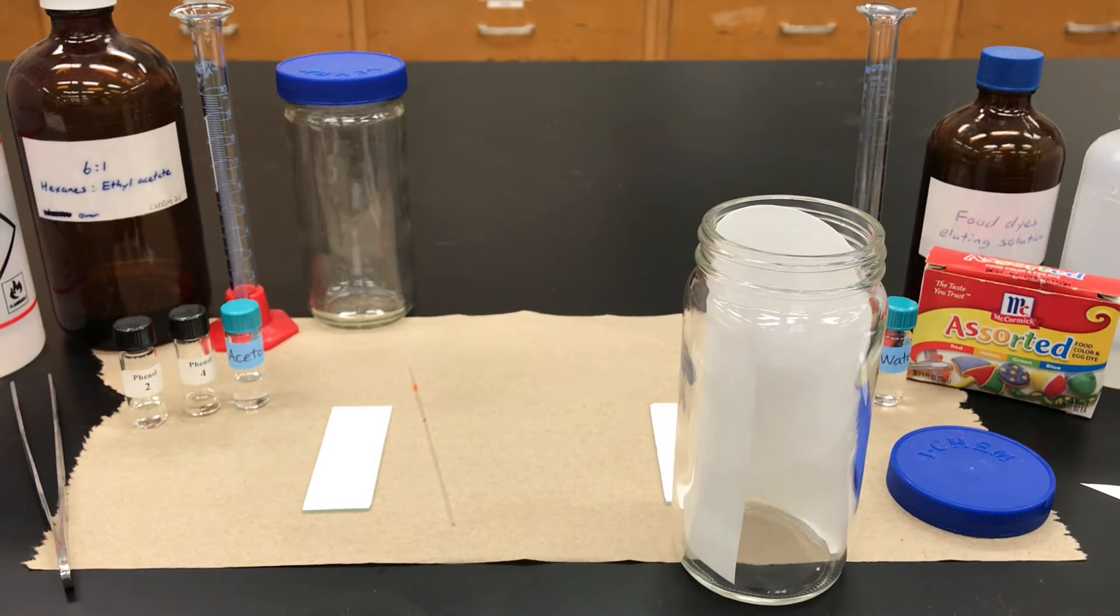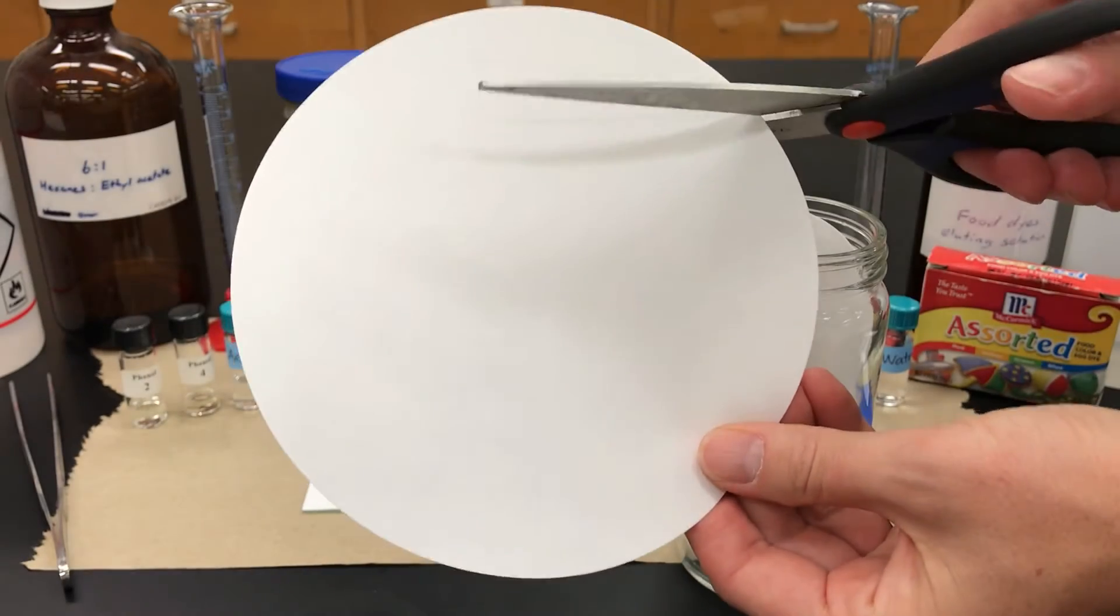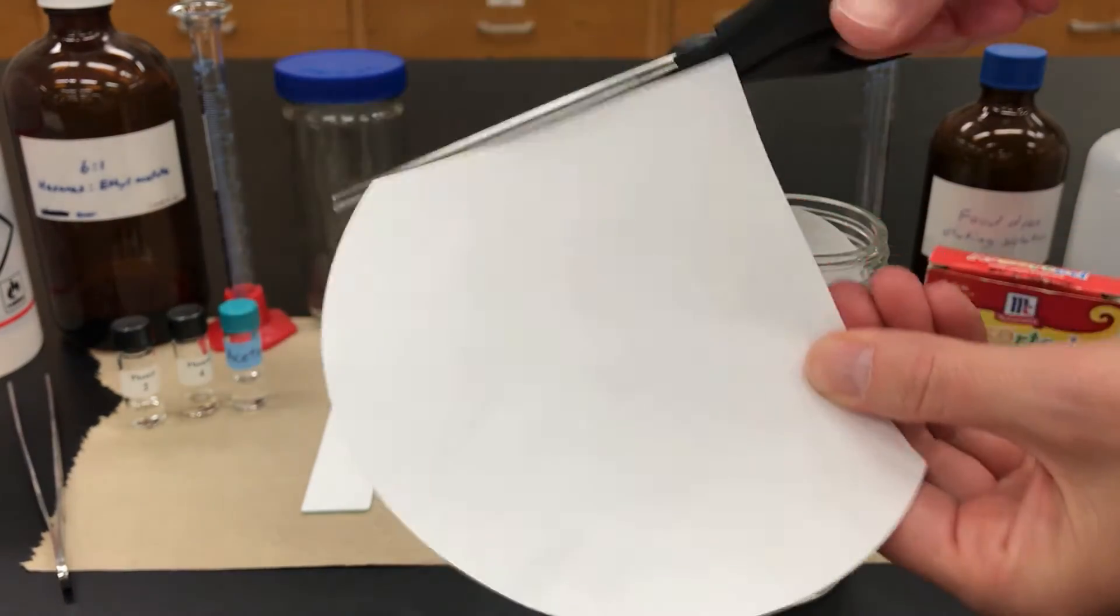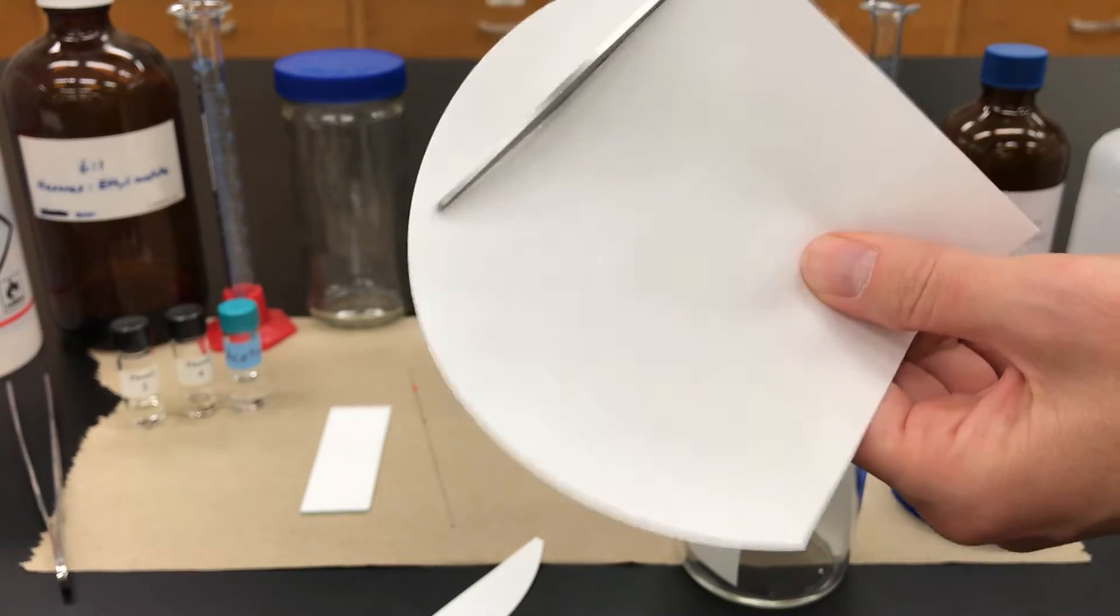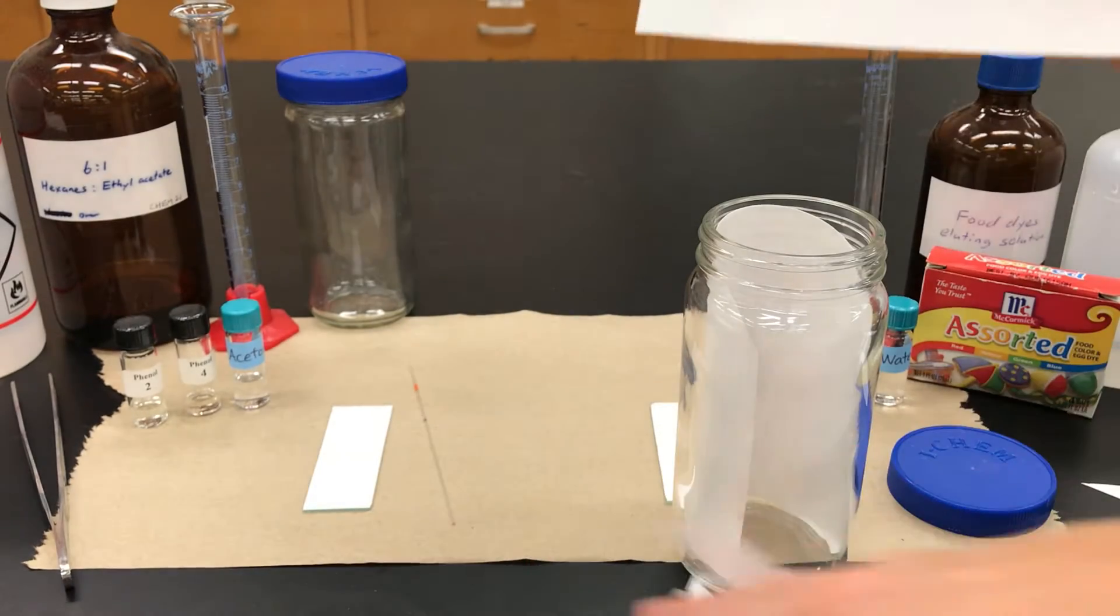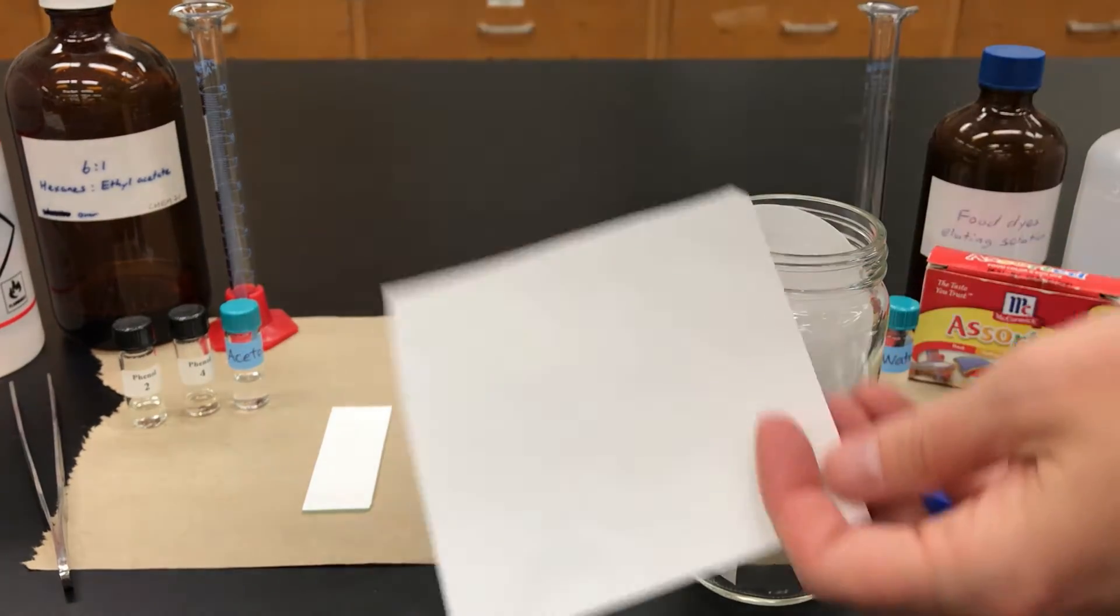I'm going to do the same thing for the second jar. This time I'm going to cut all four sides. That's really just so that when you stick it inside of the jar, it's not obscuring your view that you can still see inside.